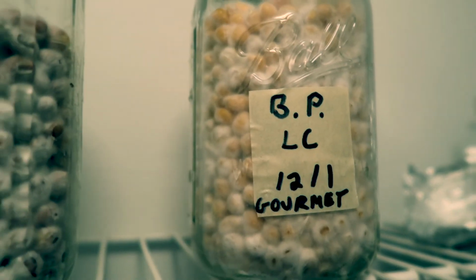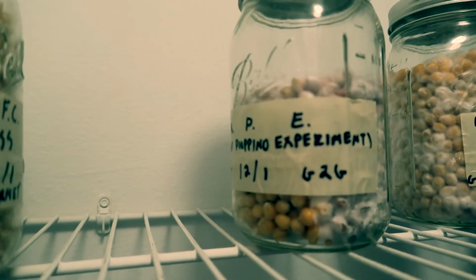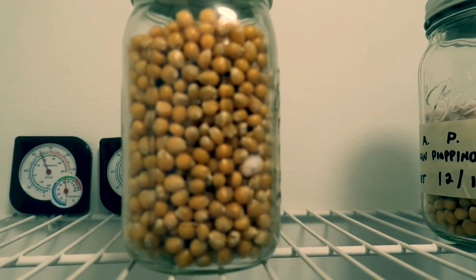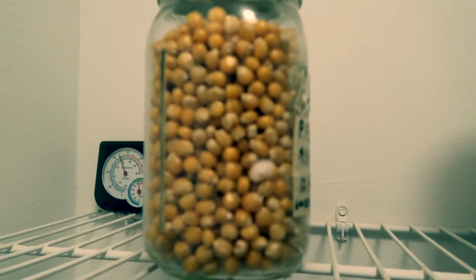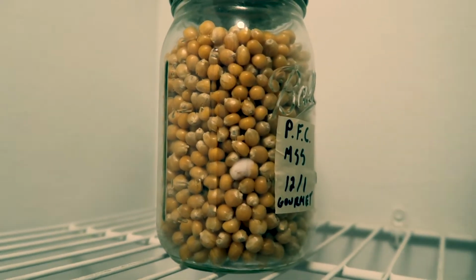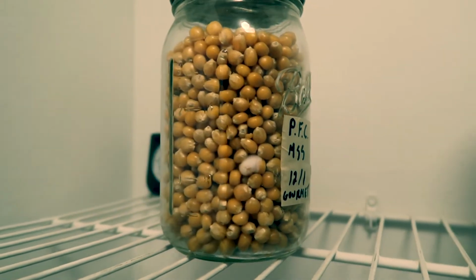So if you're going to prepare this popcorn to use for mushroom grain spawn, it's most beneficial for a grain-to-grain and liquid culture inoculation. If you know you're going to use a multi-spore inoculation, at least add some coffee, or if you're patient enough, you can just wait for these two little spots of mycelium to finally take over all of these grains.